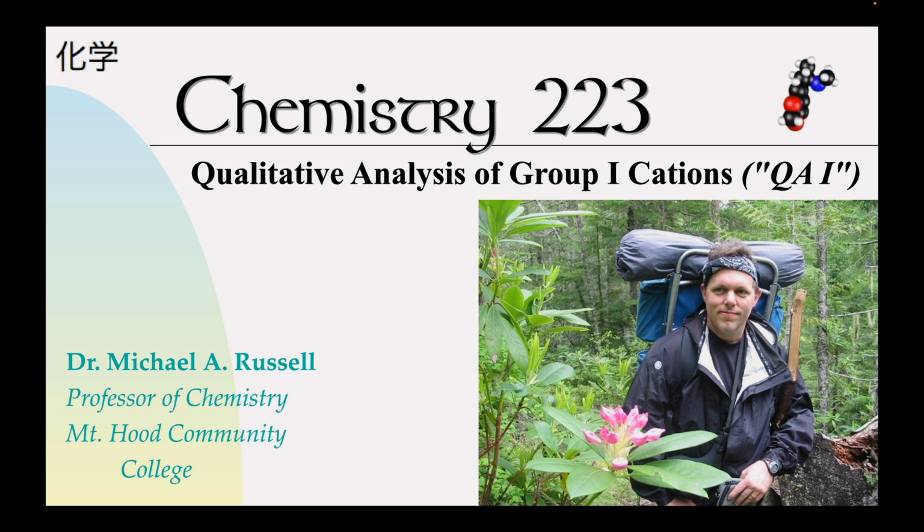You can probably see why a lot of times I abbreviate it QA1, but anyway, this lab will be a lot of fun compared to a lot of the labs we've done recently because, first of all, there's no math. Wah, wah, wah, I know. Anyway, a lot of chemistry, of course, depends on math, so I'm not saying math is bad. However, it is kind of fun to have a lab which is all based on experiments and seeing colors, precipitate, stuff like that. So QA1 is a lot different. I think you'll enjoy it.